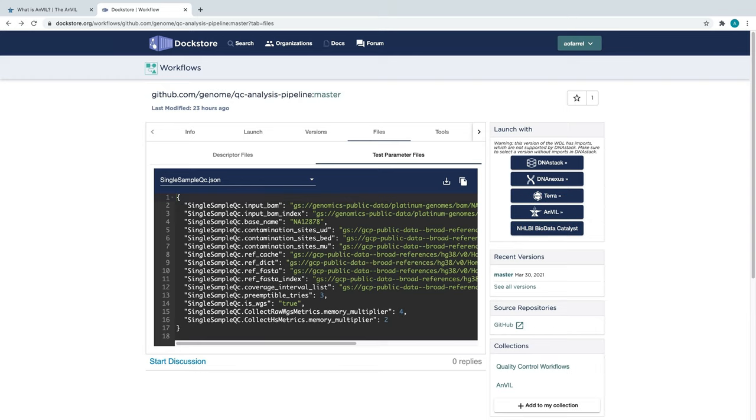One thing we would like to clarify is that clicking the Terra button located just above the Anvil button will also import the workflow into Terra, but it'll be the non-Anvil instance of Terra.